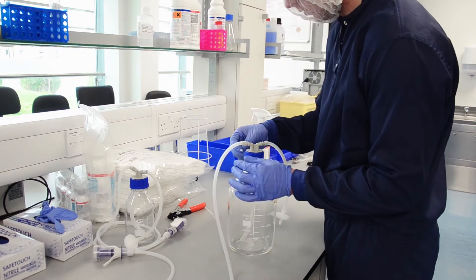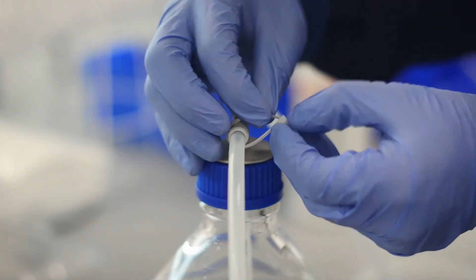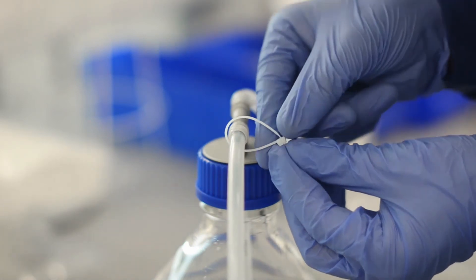Another piece of tubing with a hydrophobic filter is attached to the outside connector. This ensures that the air that flows into the bottle to relieve vacuum is sterile.